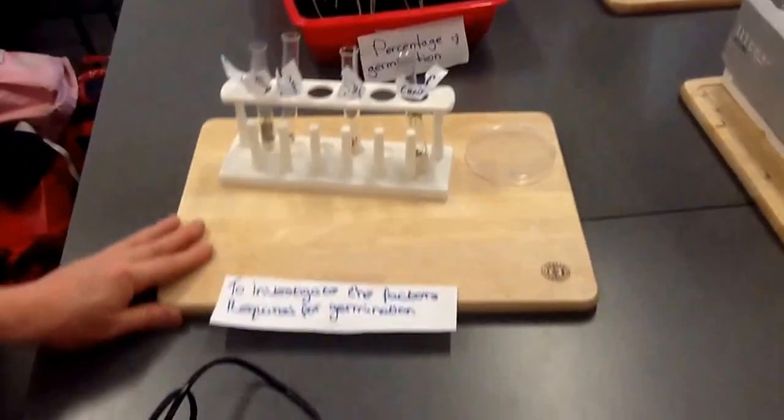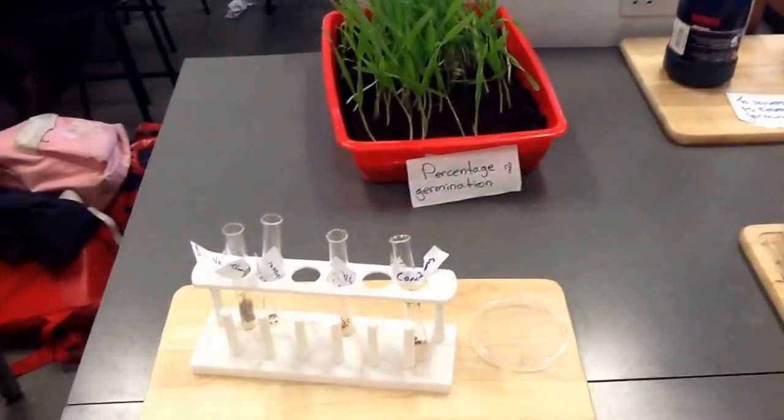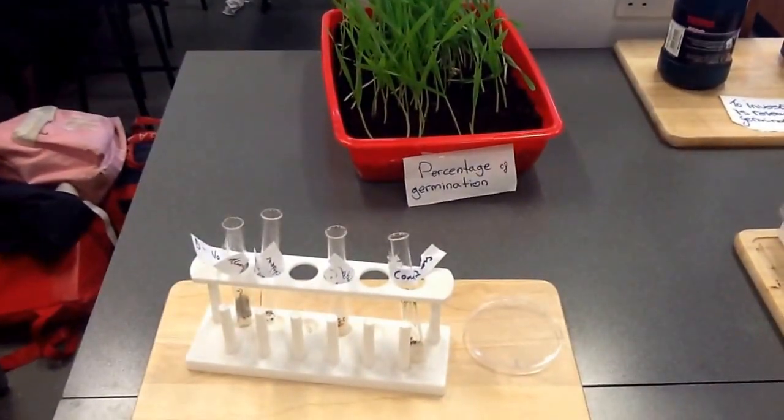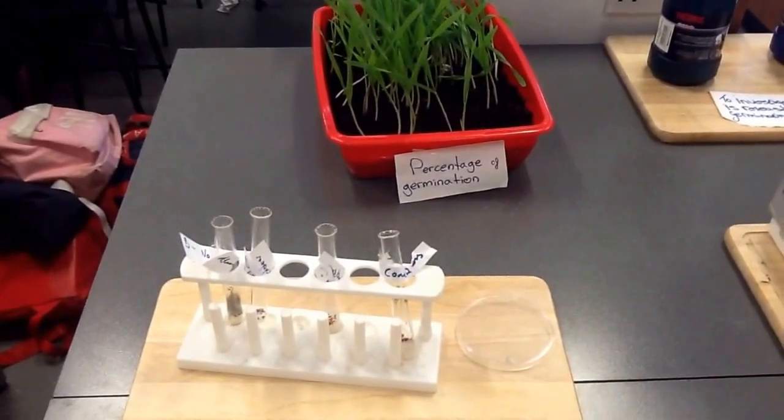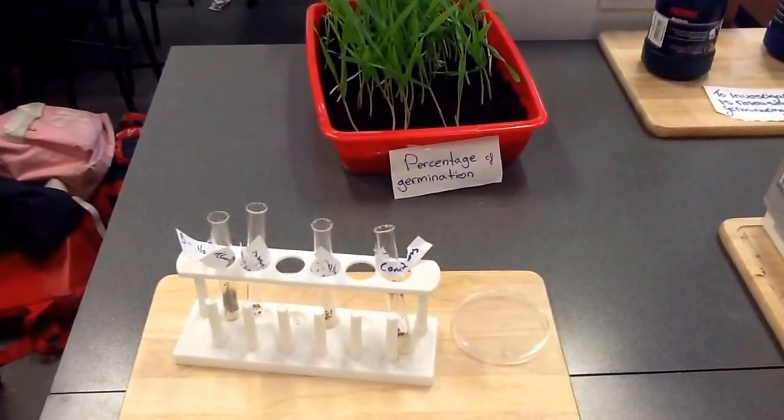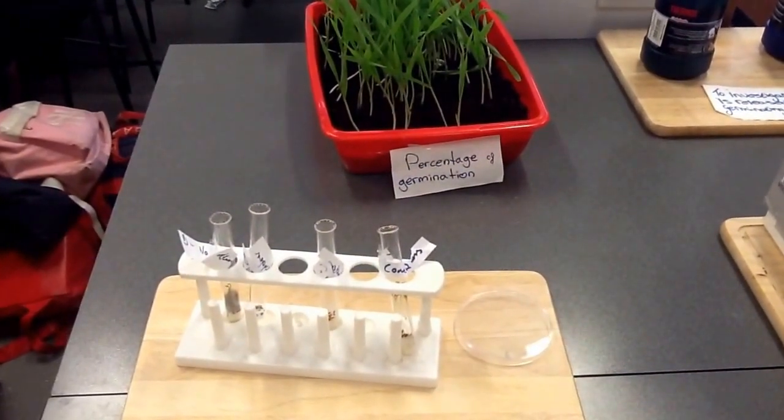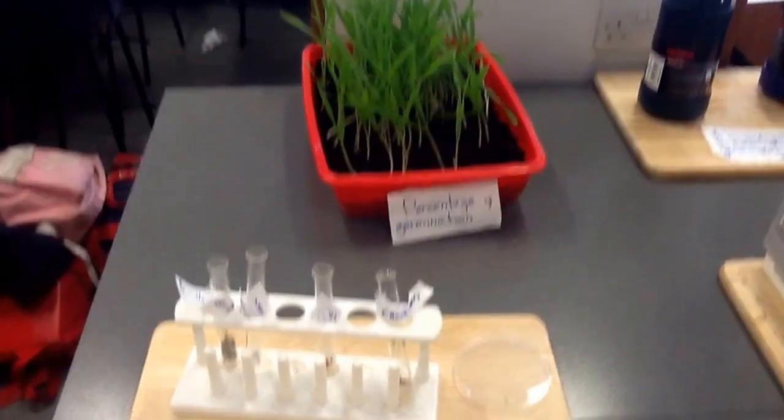The next experiment is the percentage of germination of corn. We got 100 seeds, planted them, let them germinate, counted them, and got 88% germination in this instance.